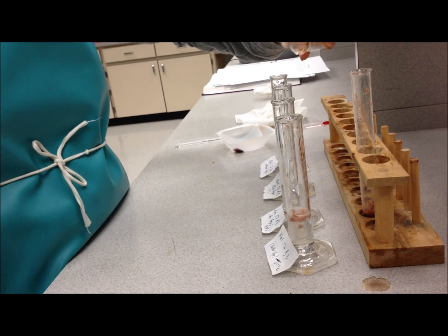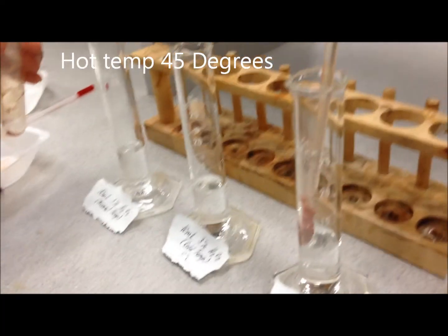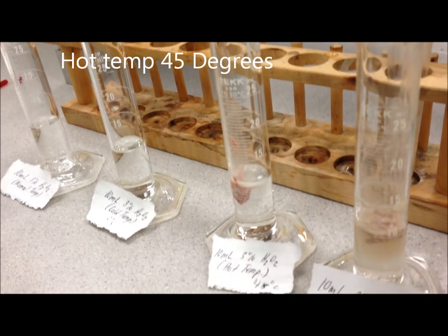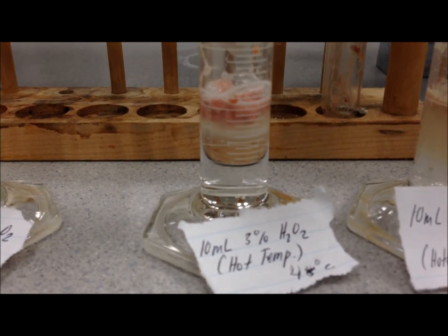We placed the third test tube into a beaker with crushed ice and waited until the temperature reached 0 degrees Celsius. Then we placed the liver from the cold test tube into the second container, which is a cylinder, containing 10 milliliters of 3% H2O2. Then we put the leftover crushed liver directly into the third container, which contained H2O2 solution.